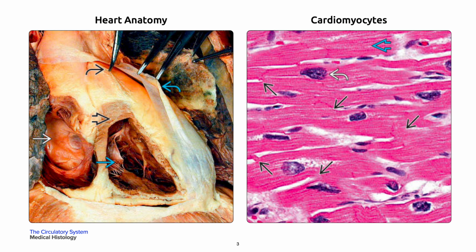On your right are cardiomyocytes, which contain sarcoplasmic cross striations in a bold blue arrow, centrally placed nuclei in a single white curved arrow, and their interconnections between the cells in a single black arrow. All of these are facilitating cellular electrical coupling.